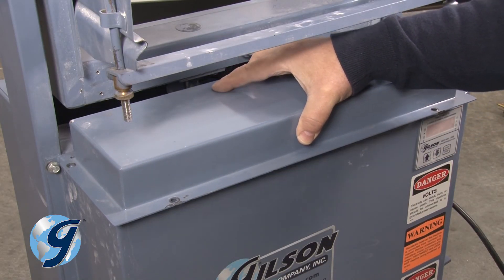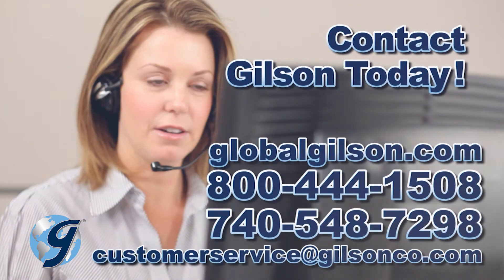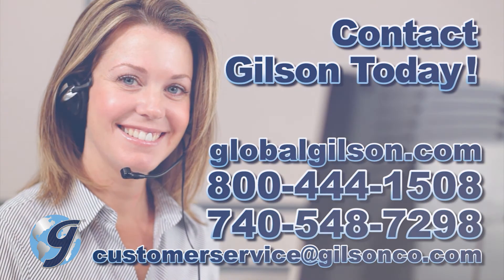Next, reattach the upper case covers. For any questions about your PortaScreen or for any Gilson product, please contact your Gilson Technical Support Team.